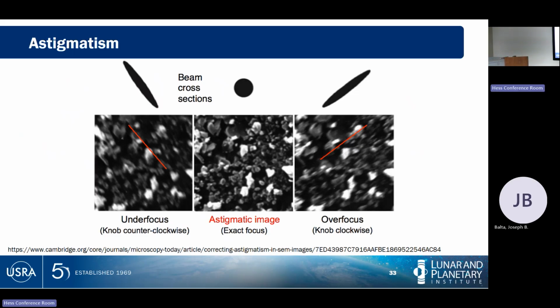There is an automatic setting for stigmatism. We also have autofocus, and considering my glasses here, autofocus works better than my eyes at trying to focus the image. The same thing applies to our auto stigmate adjustment. I'll show you how it works. If you just hit auto stigmator and you're looking at something that you're pretty sure is supposed to be round at high magnification and it doesn't look round, the auto stigmator does a really good job of improving it.